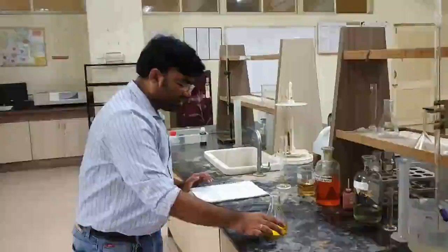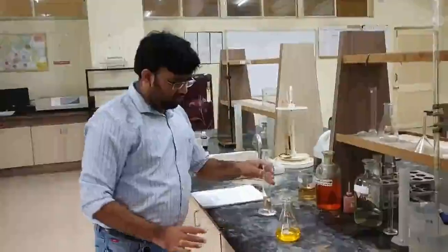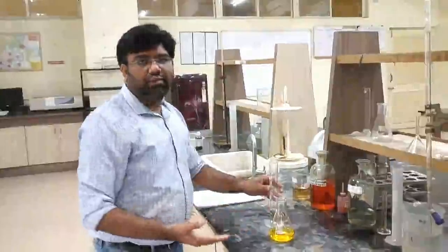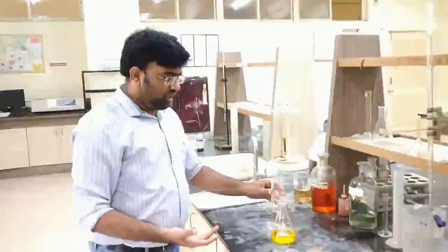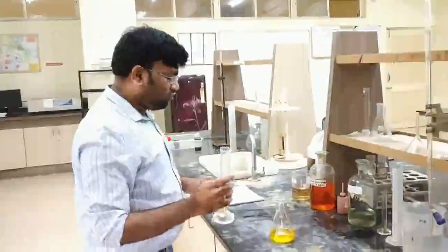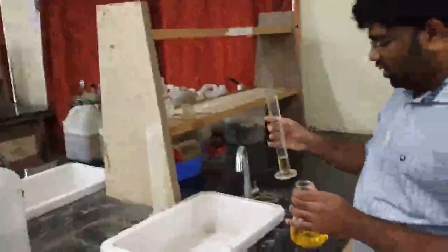Now this conical flask contains liquid, mostly water, and when we add concentrated H2SO4 to it, what will happen? There will be some reaction, right? A bumping reaction may take place, and because of that we have to add it very, very carefully. So I'll tell you how we are going to add this. We have already measured 30 ml of H2SO4.